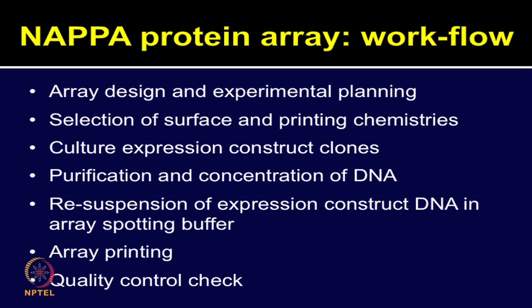What type of surface to select and what printing chemistry to use are different questions which are always in the minds of microarray researchers. Since we are talking about the cell-free expression based system, you need DNA to start with. So, how to express and construct those clones are other considerations.